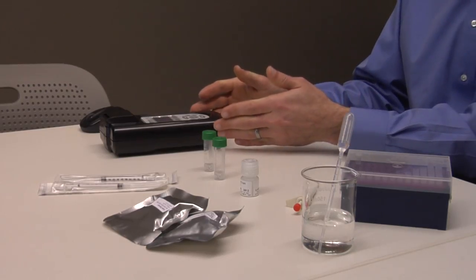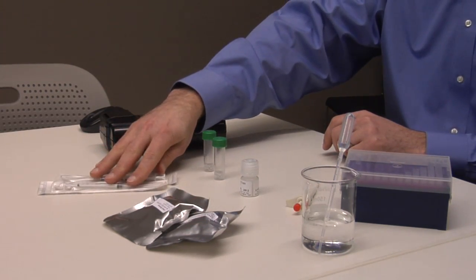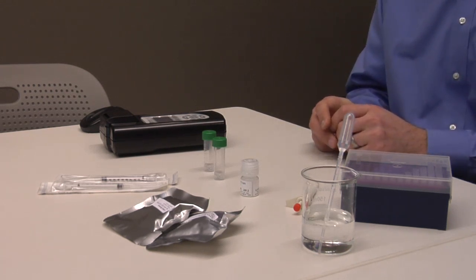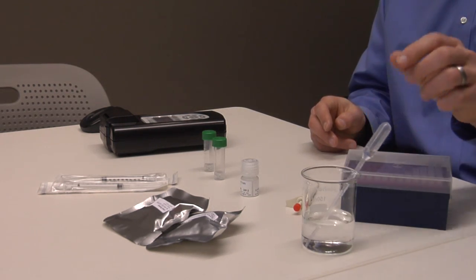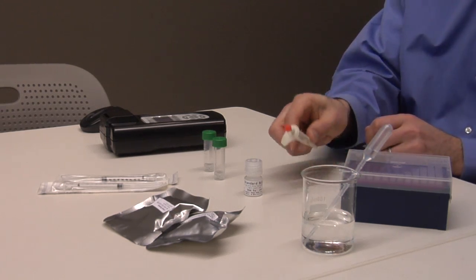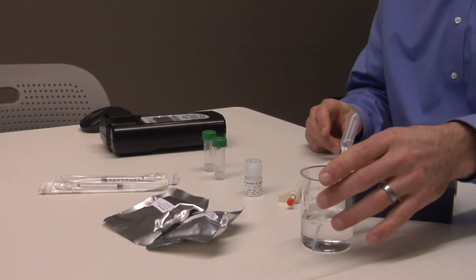As part of this test will be time sensitive, we will first prepare the required materials: an ANDalyze fluorimeter, 2 sensor bags, 2 1 milliliter syringes, 2 buffer solution tubes, 1 disposable transfer pipette, the lead or uranium standard solution, the 100 microliter pipette tips, and 1 sample cup, which is not provided.